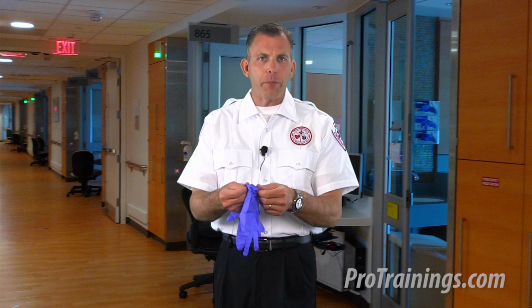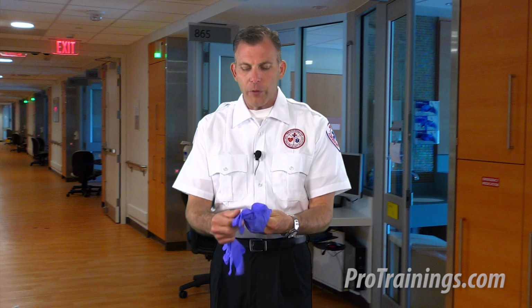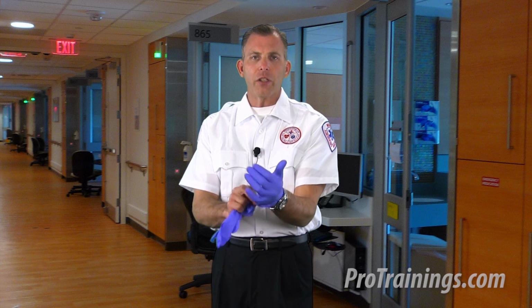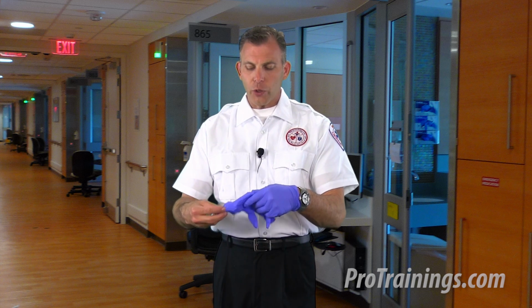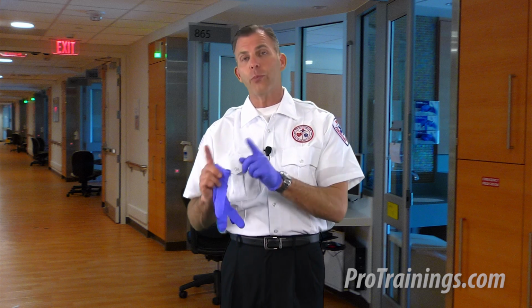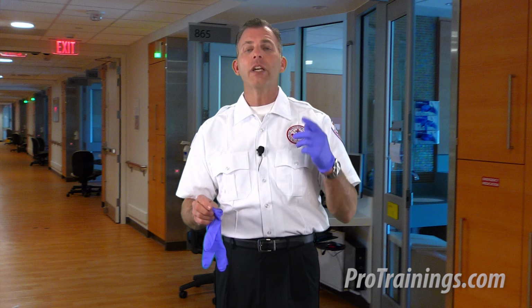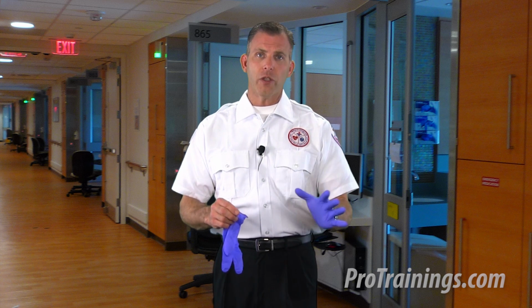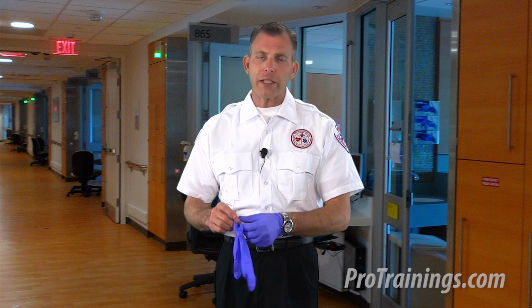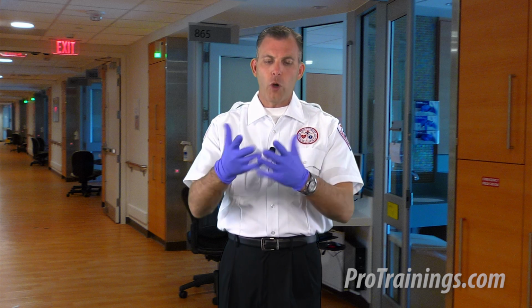Now they're kind of powdered or they have some kind of coating on there, and they're a lot better for getting them on. If your hands are real wet or sweaty, dry them off appropriately and the gloves will go on a lot better. You can also make sure that you've got the appropriate size. And for employers, it's important to get the appropriate size for your employees. If they have extra large hands, you need to get a box of extra large gloves. Giving them a one size fits all and then they rip every time they put them on is not appropriate.